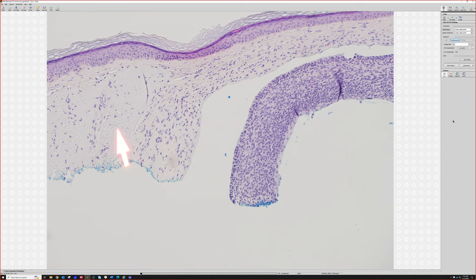Tony Subtil, who's a great hemopath, dermpath, mentioned at a meeting once that the stroma of basal looks kind of like chubby neurofibroma cells. I hope I'm not taking his phrase too far out of context, but he said they look like nerve fibroma cells, but more plump. And I thought that's a beautiful visual explanation that I had never thought of, and I love it. So I think he's right. The stroma looks a little neurofibroma-esque, often with a little myxoid change.